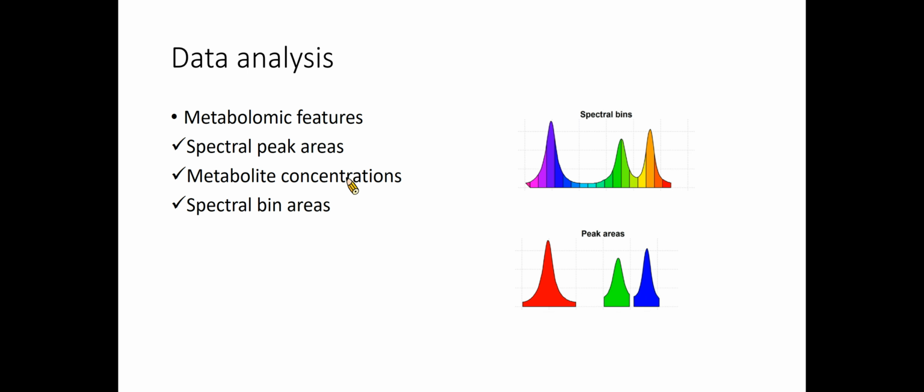This type of feature allows both to reduce the high redundancy of peak areas, where one metabolite is often represented by multiple spectral peaks, and to provide the biological significance to all the analyzed features.